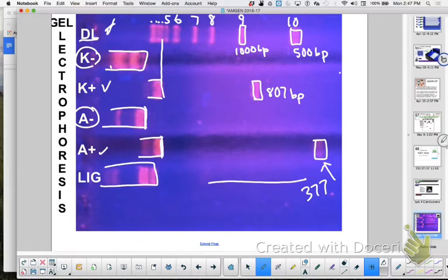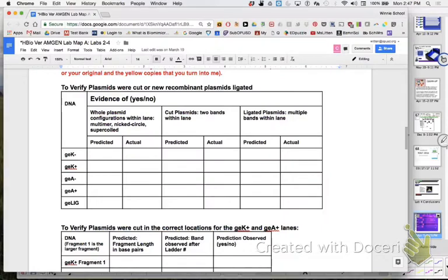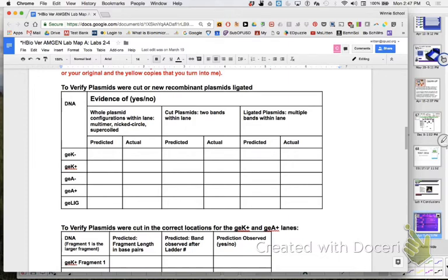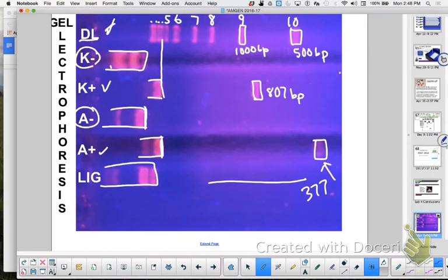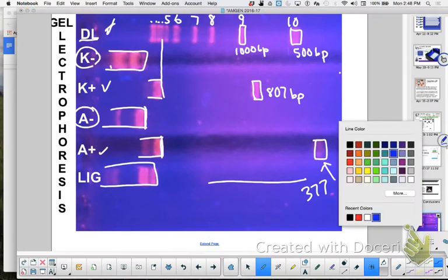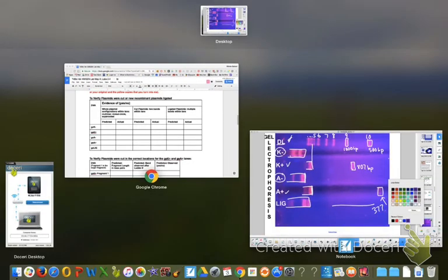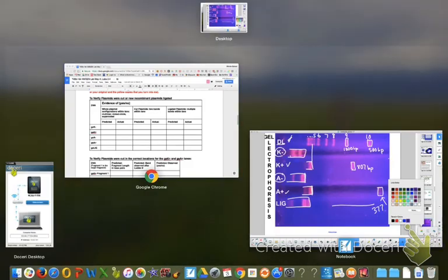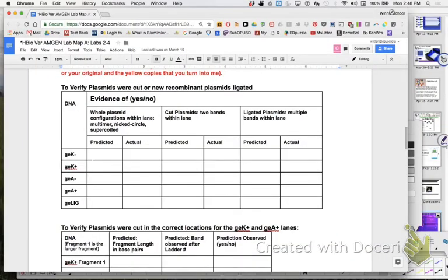So now let's take that information and apply it to your data table. The first data table says whole plasmid configurations within the lane: multimer, nicked-circle, supercoiled. Would we expect the K minus to have whole plasmid? Yes, I would. Would you expect K plus to have whole plasmid? No. Would you expect A minus? Yes. Would I expect A plus? No, because it was cut.